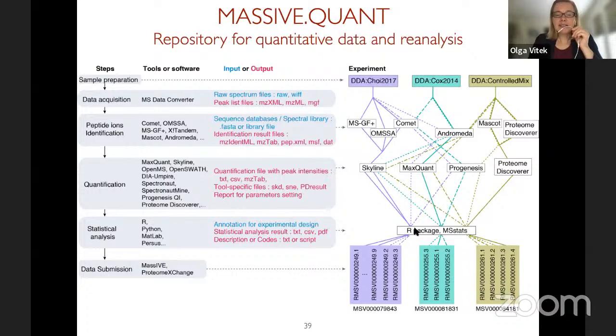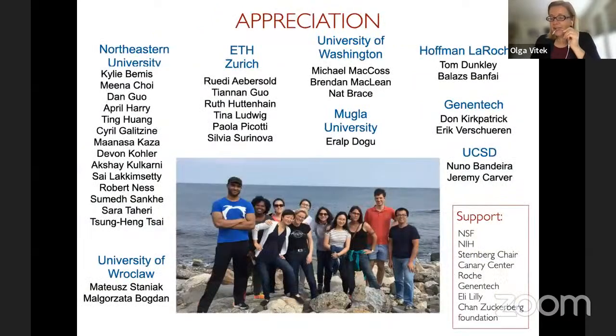And it helps us understand, again, how much our choices of data processing and of statistical analysis impact the underlying biological conclusions. Because again, as I was saying yesterday, the mission of our lab is to make sure that we detect as much biology as possible, and we're as little biased by the artifacts of data processing as possible. So that's all I had to share for today.